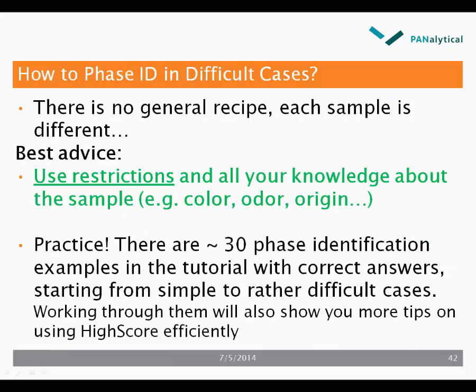Often I'm asked how to perform phase identification in difficult cases. Well, there is no general recipe because each sample is different. The best advice I can give is to use restrictions and use all your knowledge about the sample, like color, odor, origin, and more. And then practice.